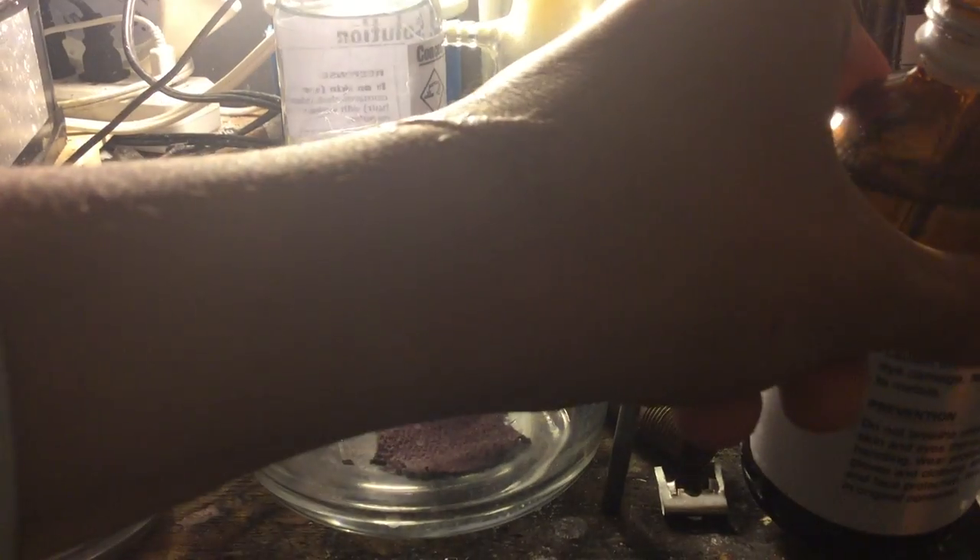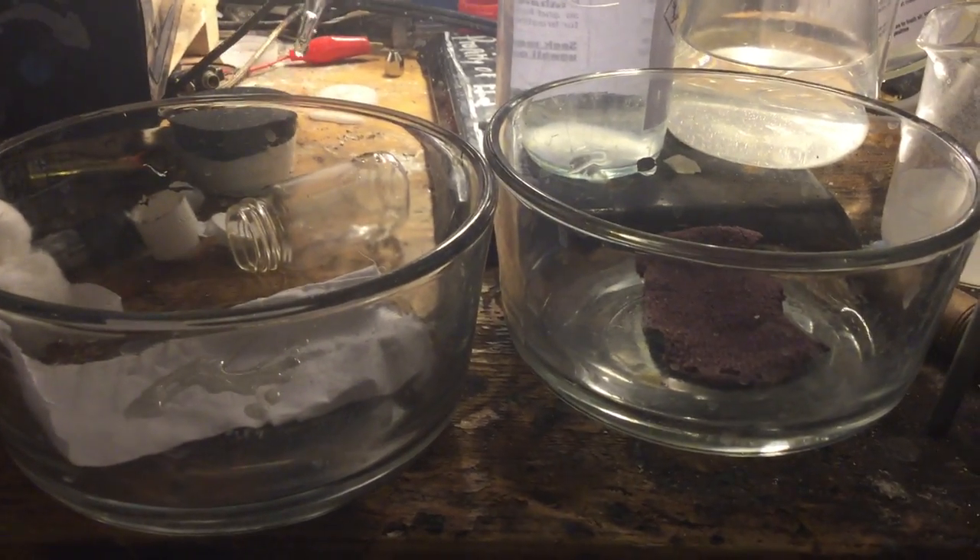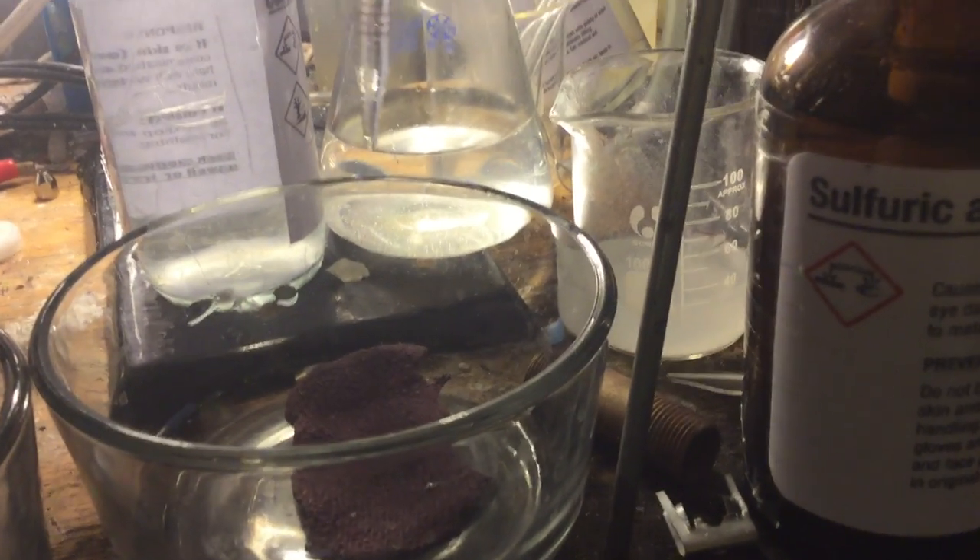Now I'm going to pipette some onto both of them. Here it is — here's some on the lab coat. As you can see, no very fast reaction. And here's some on the polyester cloth.